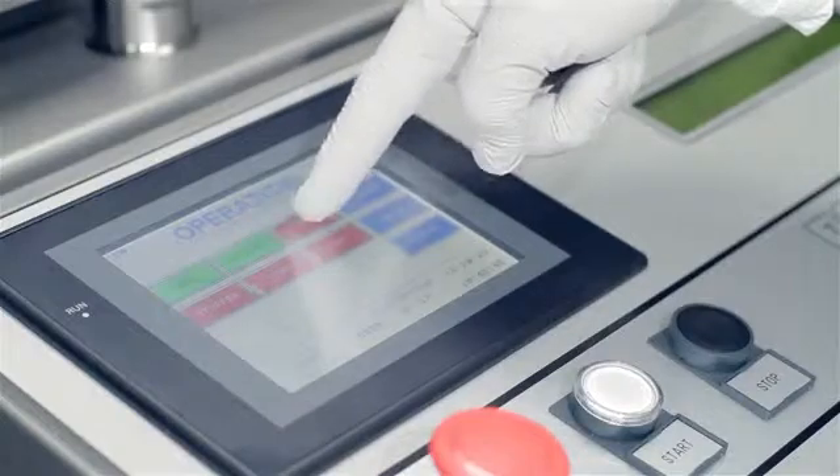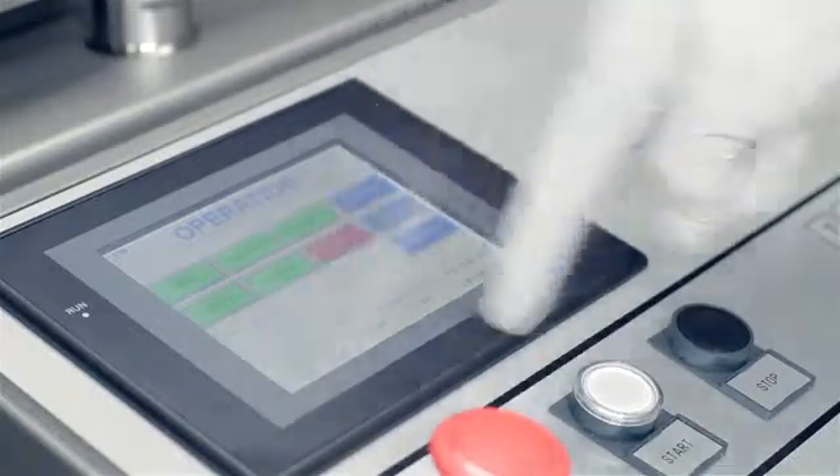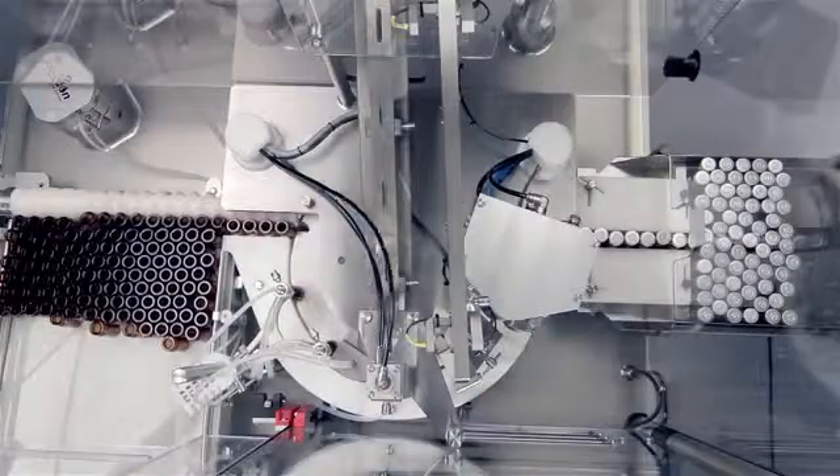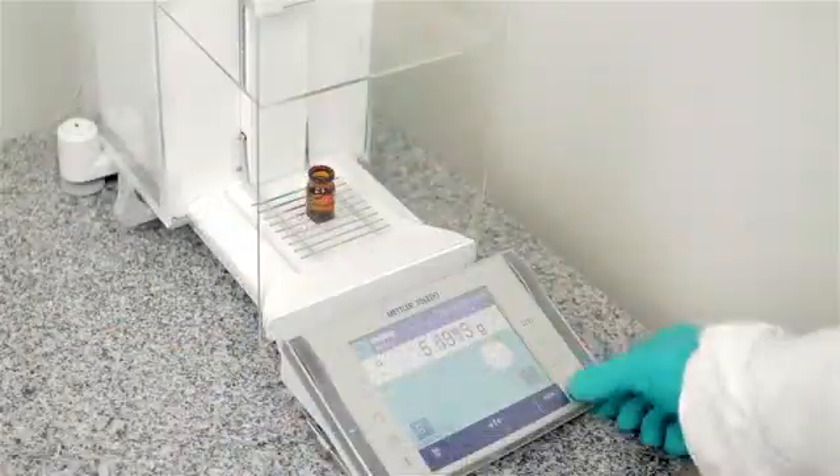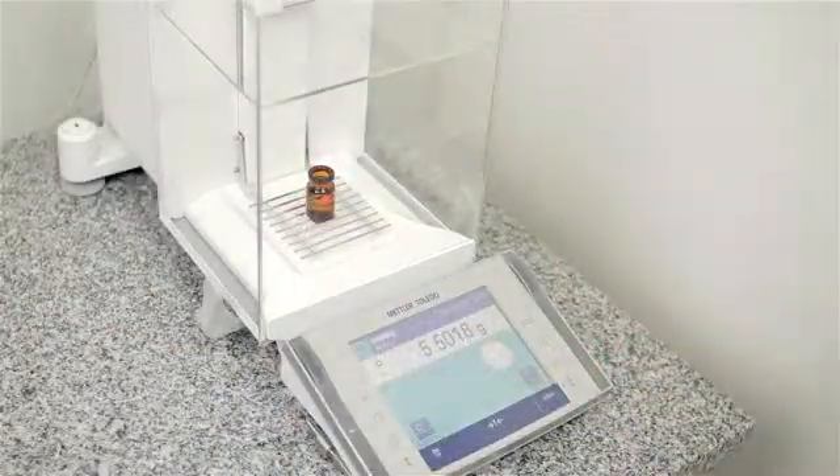An intuitive HMI ensures easy changeover without the need for support from outside the cleanroom. Calibrating the fill volume is easily done and documented using a standard balance connected to a control panel.